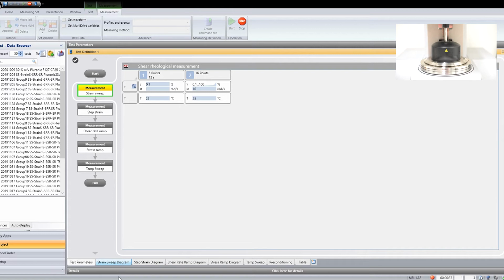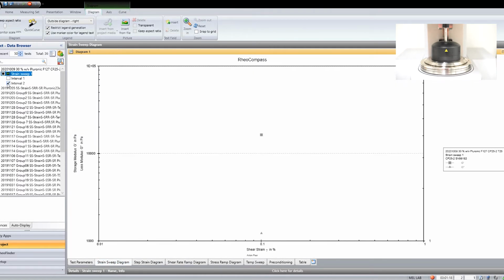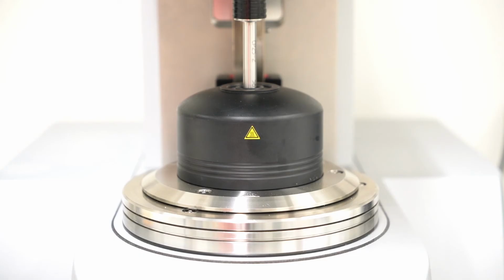At the beginning of the measurement, we will see a linear viscoelastic regime, so that the storage and loss moduli are at constant values, even as we are increasing the strain. However, at some point we will see some changes. So what do you expect to happen to storage and loss moduli as the strain is increasing? Try to sketch it.